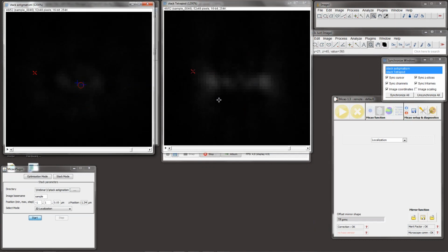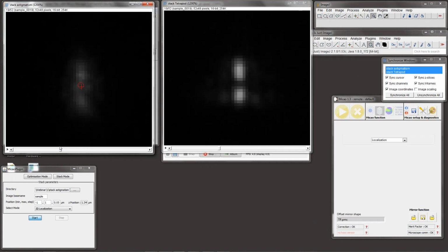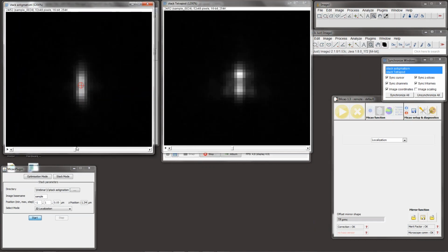This is not auto scaling, so I don't know if you can see this, but it's still visible here. And the other side as well, you can see that Tetrapod PSF is visible for much longer. Okay. So after the webinar, I think I will arrange a small presentation combining all the results, all the stacks which we acquire here, so you can examine them on your own, with your own data treatment routine.